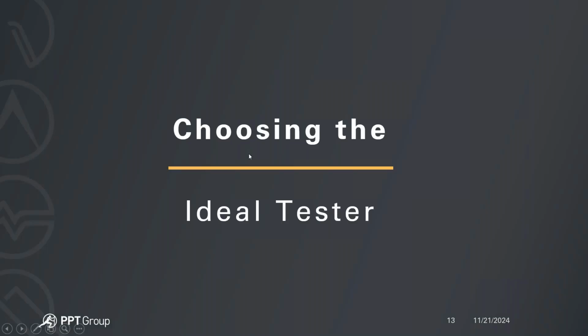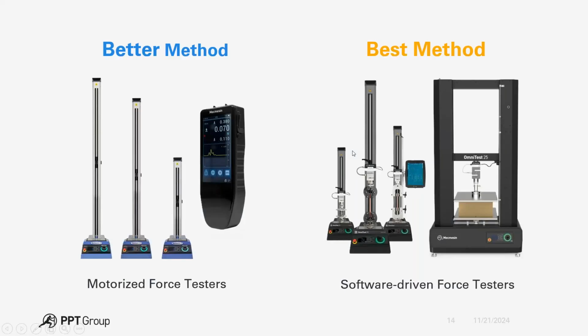All right, choosing the ideal tester. One of the questions that we usually encounter is, can I just use a force gauge and just push down and read a value? Yes, you can, but the integrity of your brand and your brand name is actually at stake. Are we going to pick the guy with the biggest forearms and have them do this? It's okay if it's some really small operation and you're not looking to make the investment, or, again, I never want to use the term quality is not a big deal. Of course, quality is always a big deal, but you could get away with that.